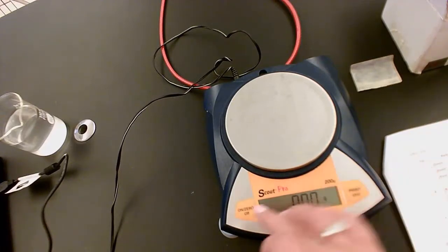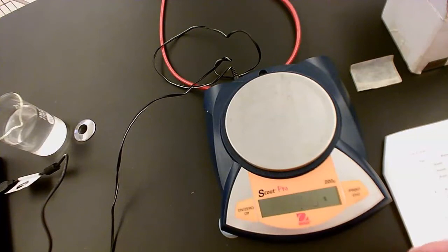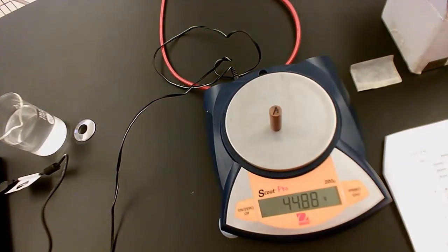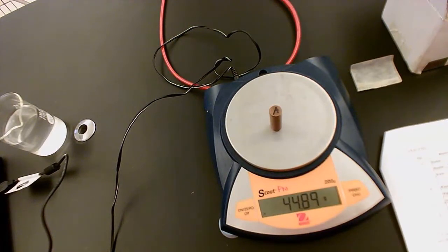Notice the balance is at 0. So I'm going to put sample A on the balance. The decimal point is right there. Right there's the decimal point. And remember to include these to 2 decimal places.